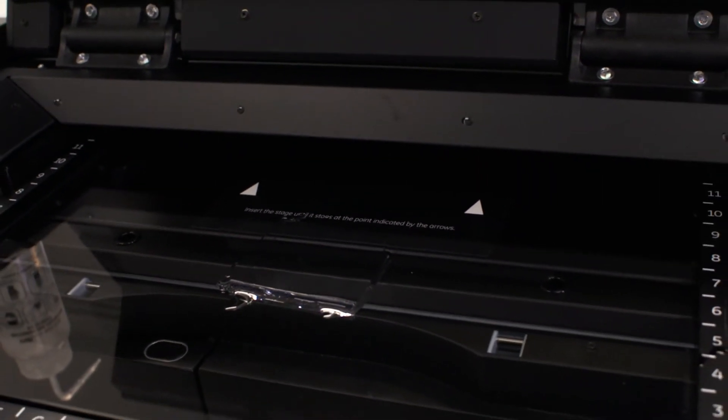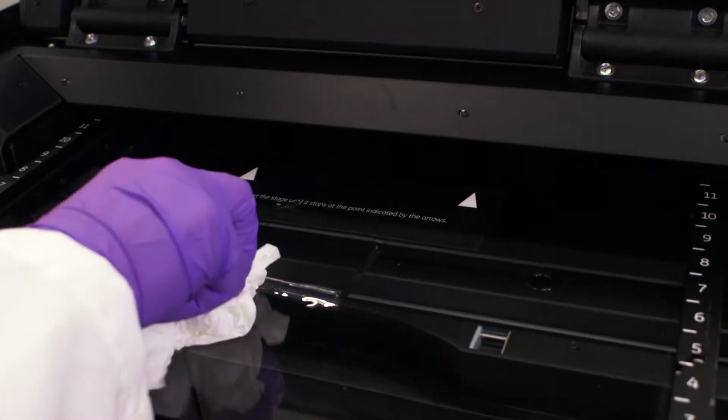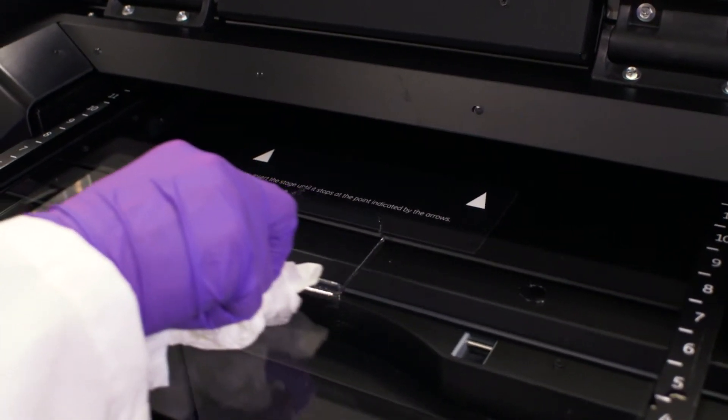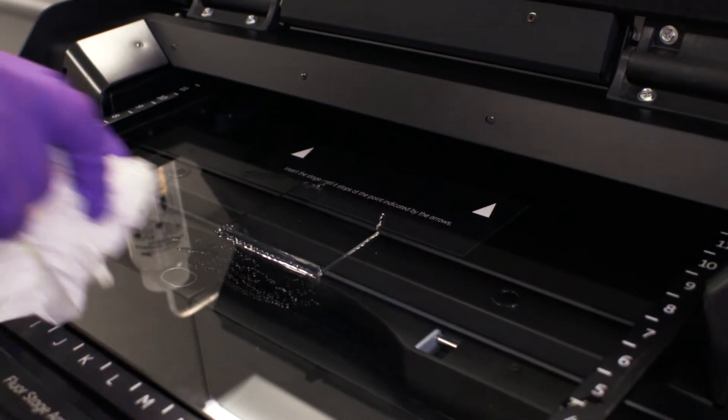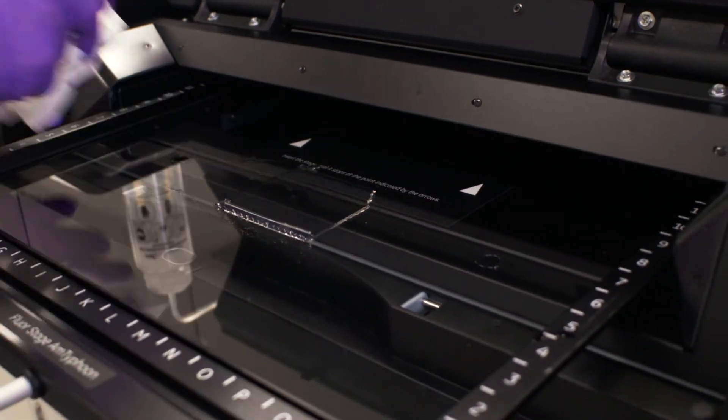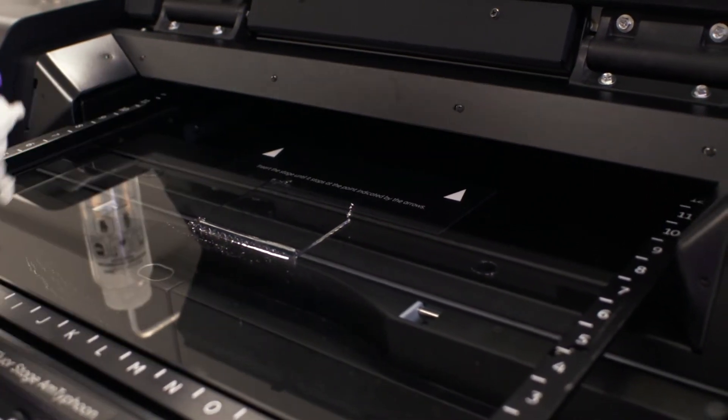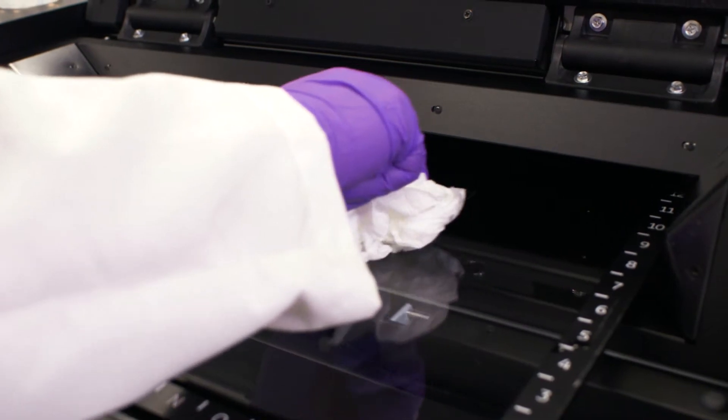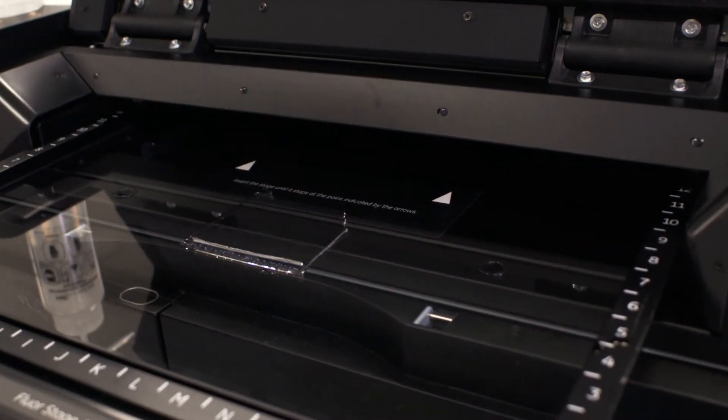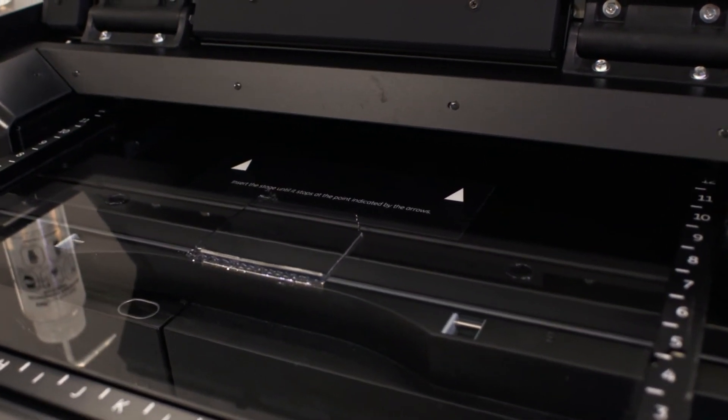Now we're going to take some lint-free tissue and suck up the excess liquid around the edge. This will pull the gel flush with the glass. We should also avoid any chance for bubbles underneath the gel. You see there's no bubbles there.